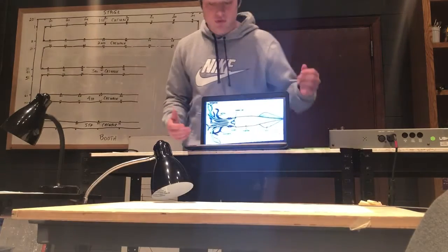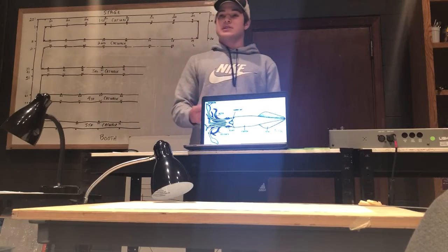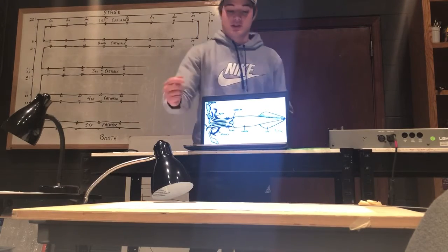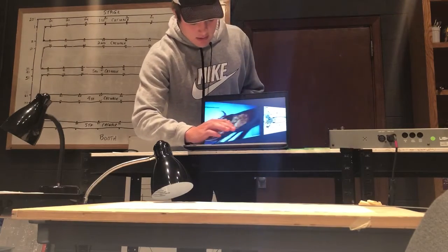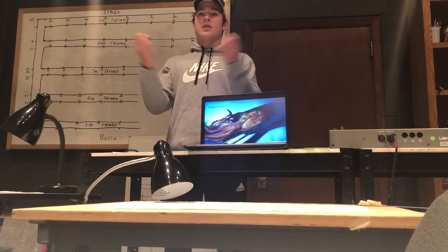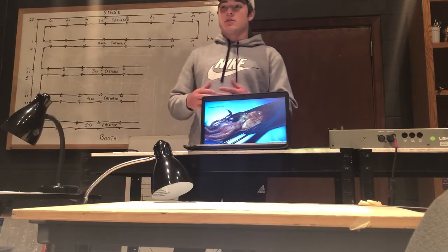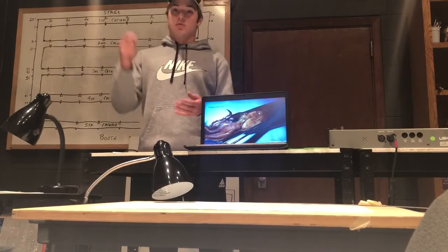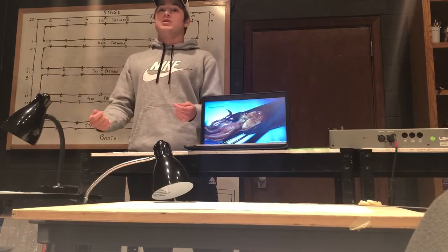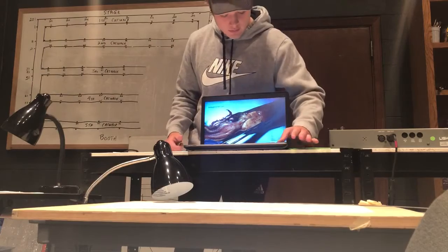you begin to cut open your squid. Using scissors, you would first cut the mantle, which is on this slide. The mantle is the outer part of the squid, kind of like a fold around the top of the squid. After you cut that, you can start using the scalpel to open up the squid and actually see the inner parts of what you're working with.